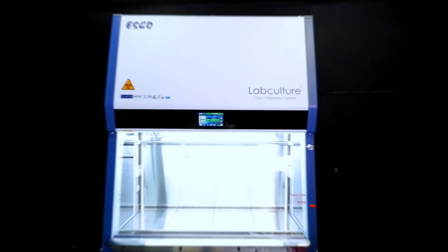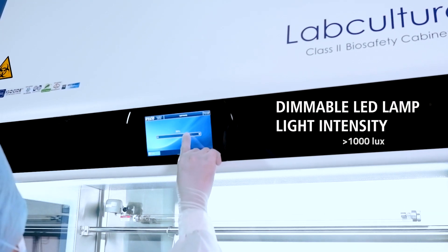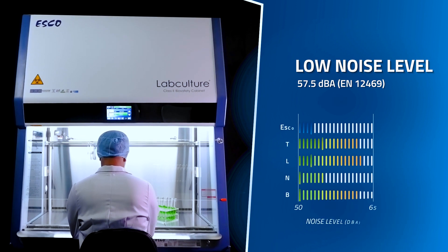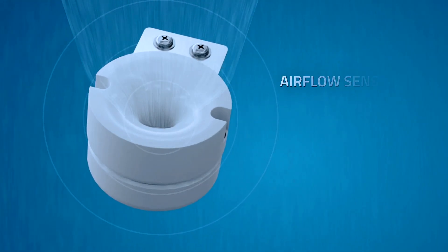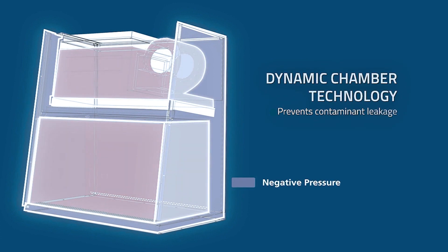Optimal lighting with brightness exceeding 1000 lux in the working area, powered by cutting-edge dimmable LED lights, providing unparalleled comfort, operating at just 57.5 dB(A) noise level to help enhance work focus. Real-time airflow monitoring via the integrated airflow sensor ensures unmatched safety through dynamic chamber technology, featuring walls under negative pressure to prevent leakage of contaminants from the work zone.